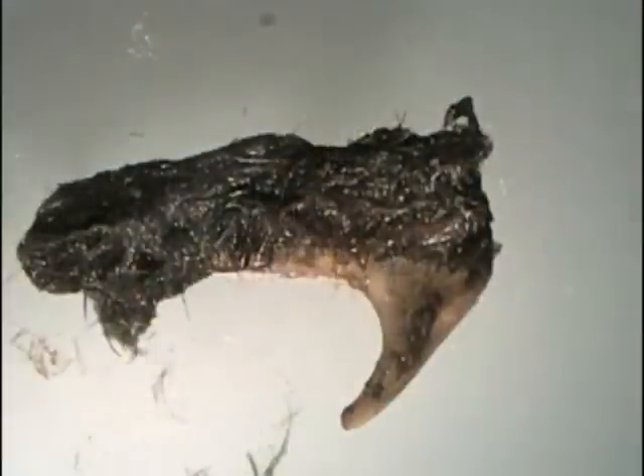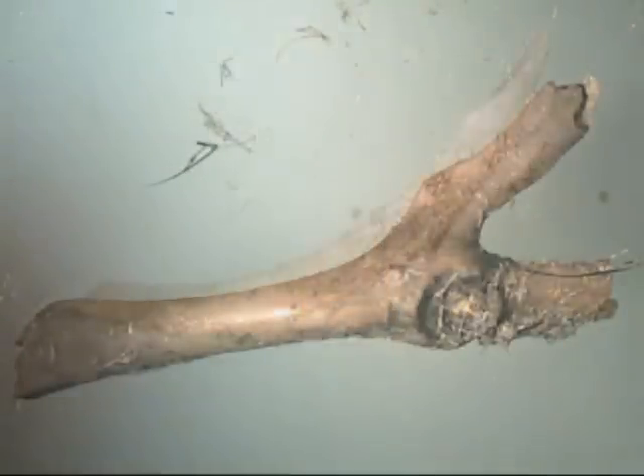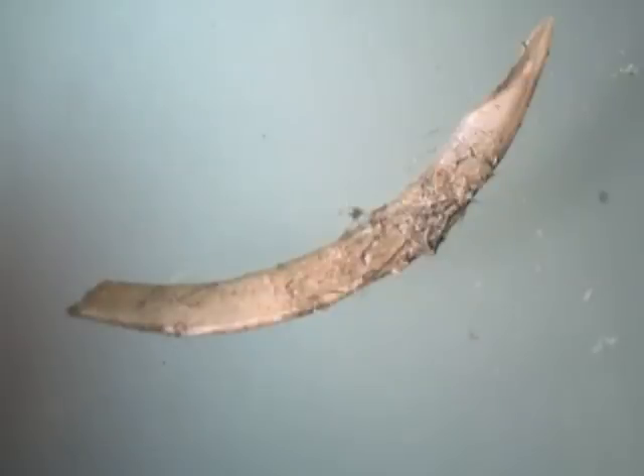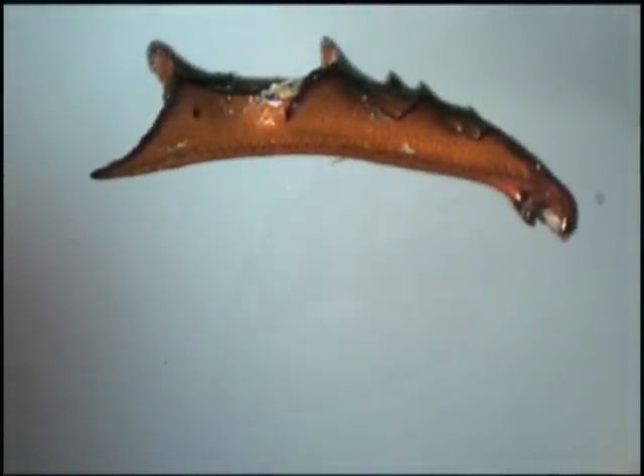Here are some other pieces of bone found in the owl pellet, and here is a closer look at some of the pieces of a beetle also found in the pellet.